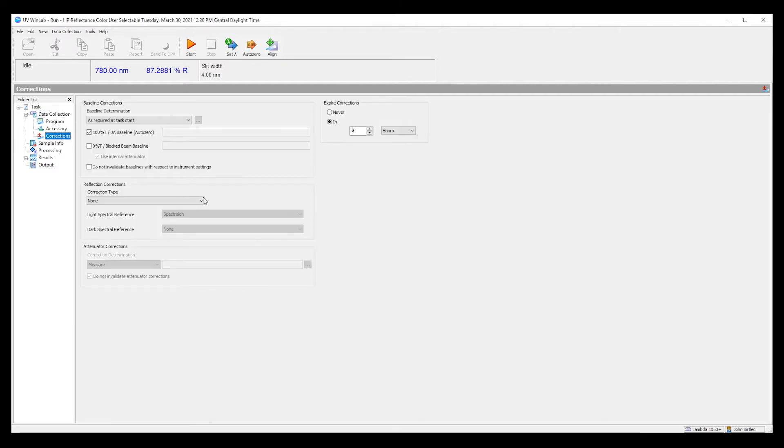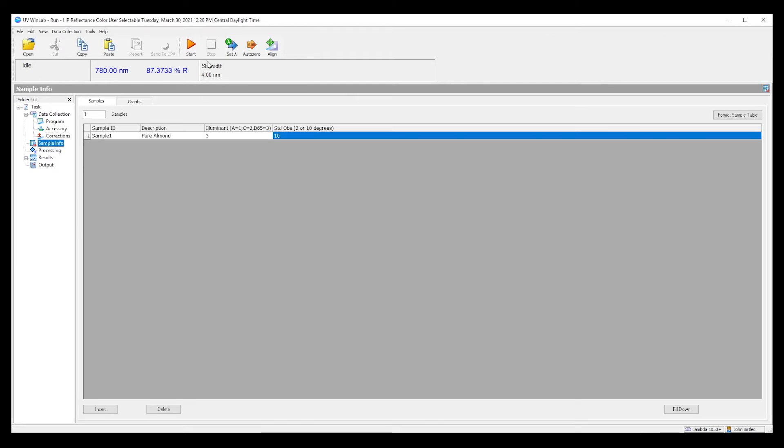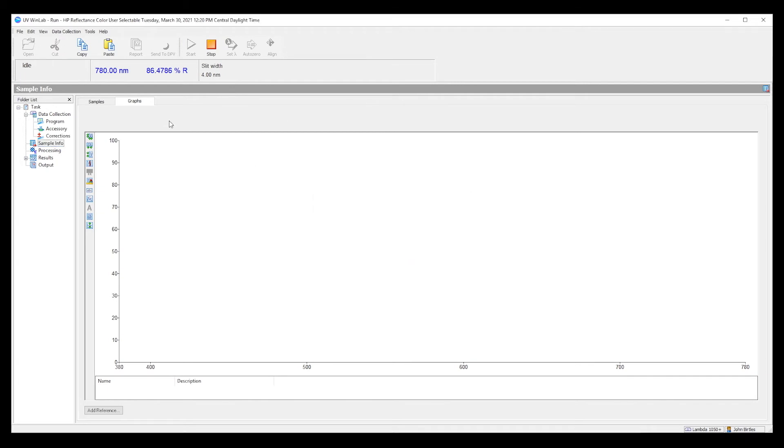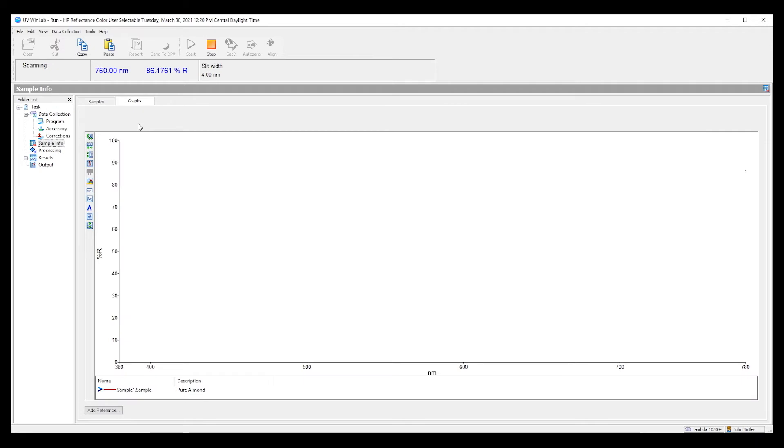In this case, we are going to correct for the spectral on puck that was used to perform the 100% correction as it's termed. And then we press run for the sample, which we've defined to be pure almond, one of many colors that are available at your local paint store.